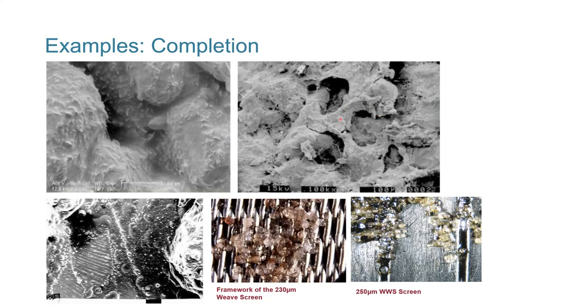But what happened was when we added the gravel and the mud together they weren't a good combination, because we're in the wellbore here, looking back towards the formation, and we've removed the screen and we've removed the gravel, but are leaving the reservoir and the remnant mud cake. So you can see where my pointer is now. This is the open pore network below, and there's grains below. And then we've got this, let's say 50 to 100 micron thick layer of amorphous material, which is the operational fluid cake. And you can see we've got these kind of circular fossils of where the gravel has been.